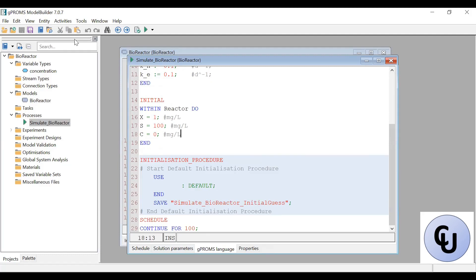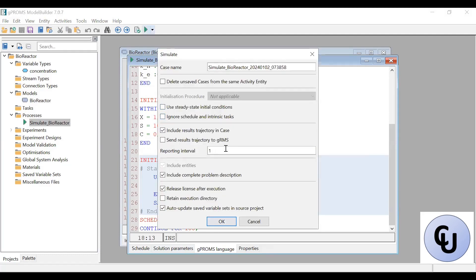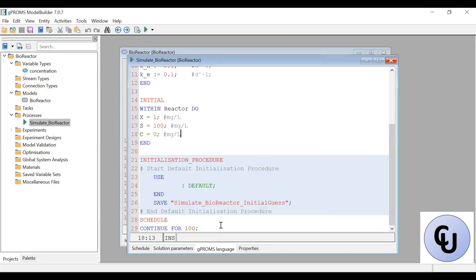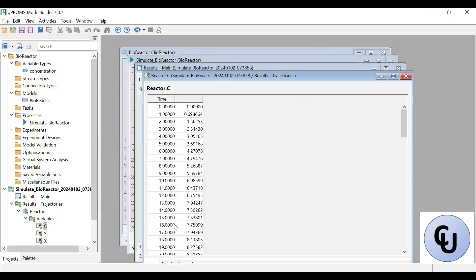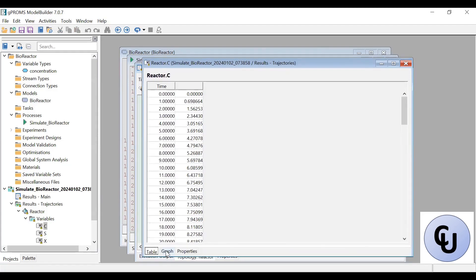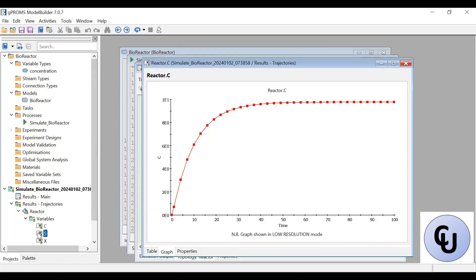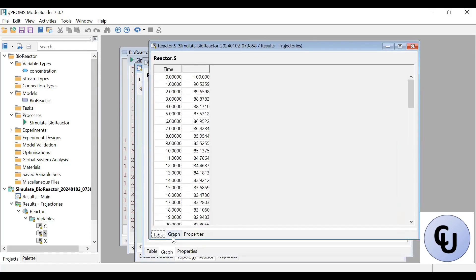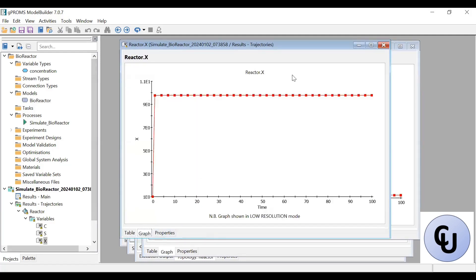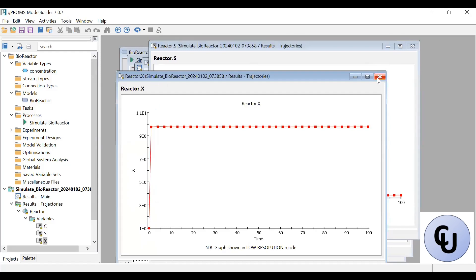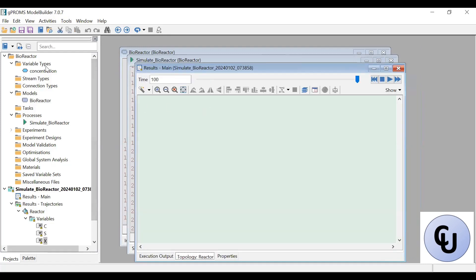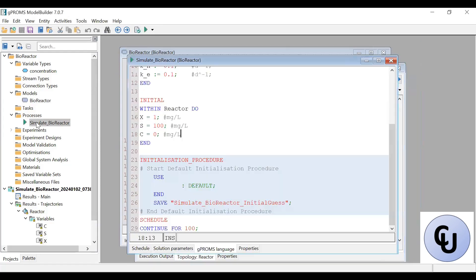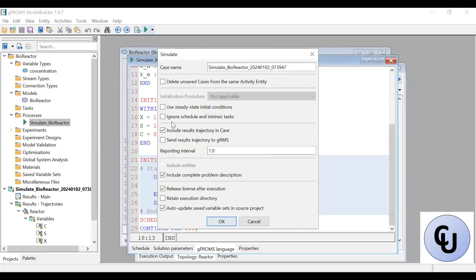To run it, we'll hit the run button. Let's use the reporting interval of one. Then we have the solution — we open the variables and see the concentration profiles for the detritus, for the substrate, and for the bacteria. If you want to put the three together, you can send the result to gRMS. We can run again and send the result trajectory to gRMS by checking that button.